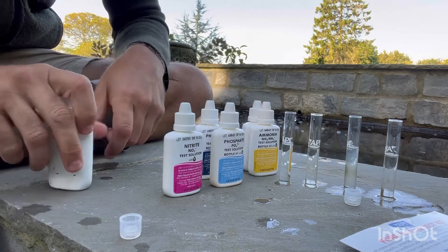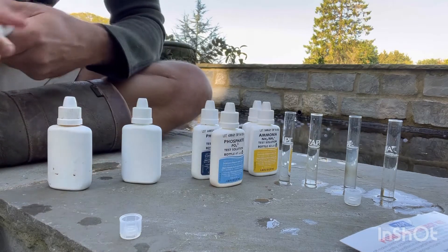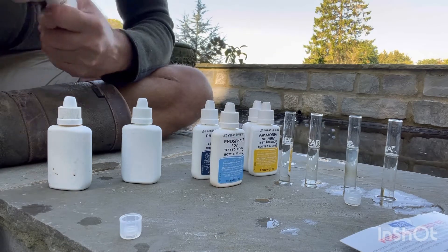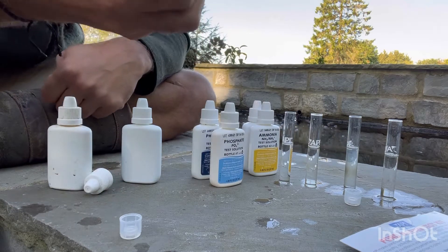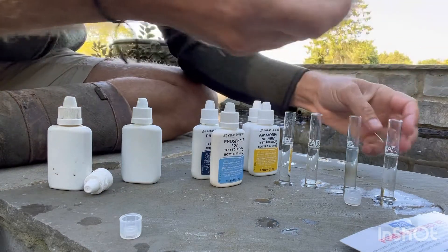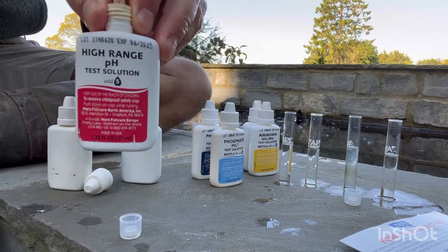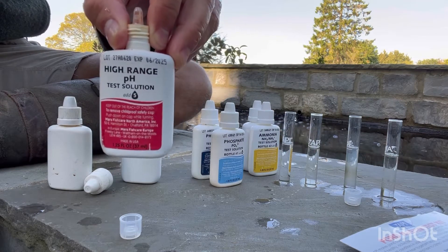I'm going to start with a high range pH test solution because my pH seems to be creeping up a little bit. Then I've got a wide range and a normal pH test solution so I can do that as well. All the instructions are on the bottle and in the packet — it tells you whether to shake, how to mix and all that sort of stuff.